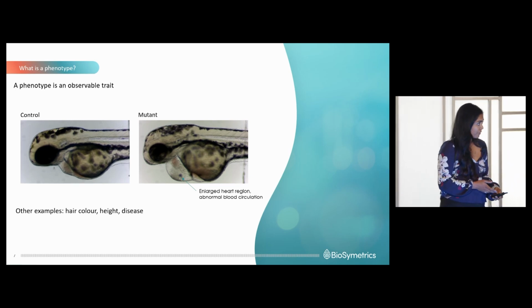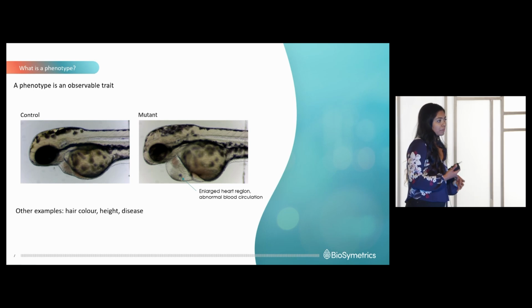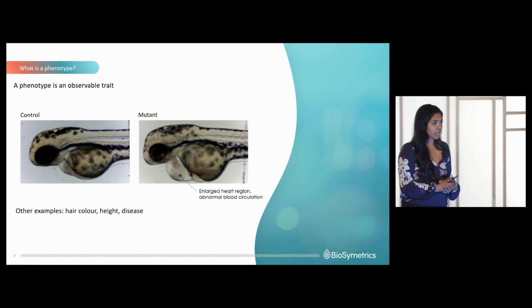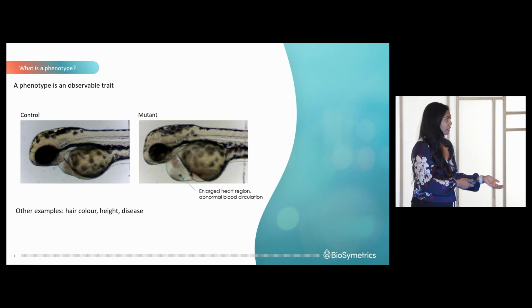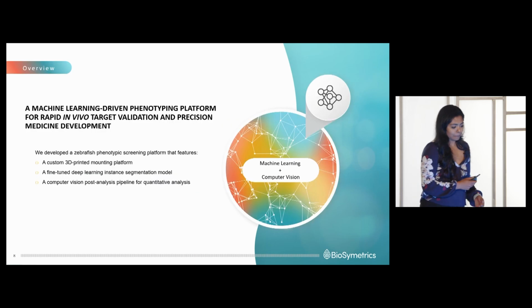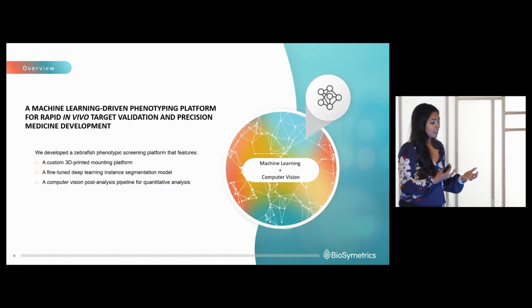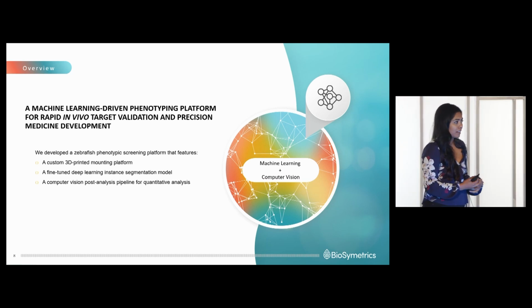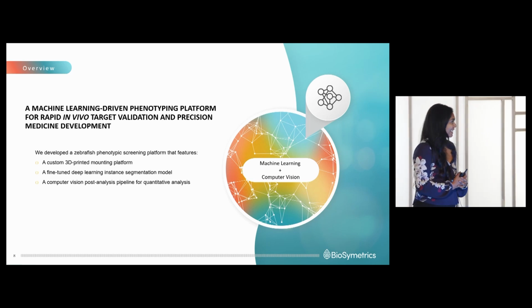For this specific video, we've disrupted the gene called MYH7, and that caused this specific phenotype, which is fairly important when we want to quantify said cardiac phenotypes. So just taking a step forward into the actual abstract or case study, now that we are hopefully on the same page in terms of the biology lingo.